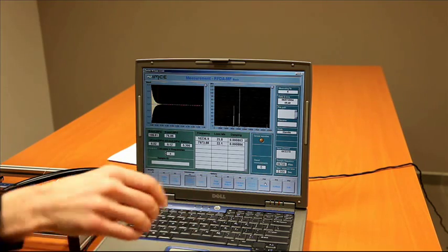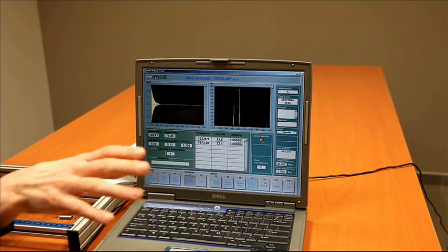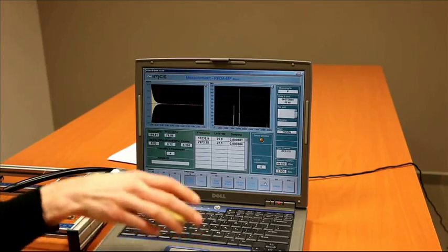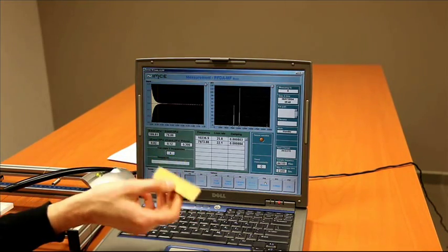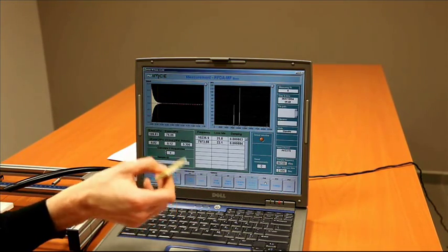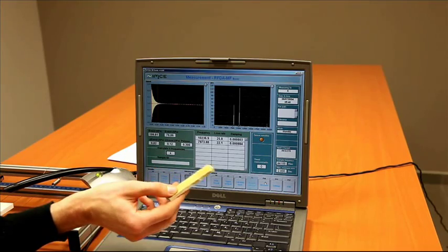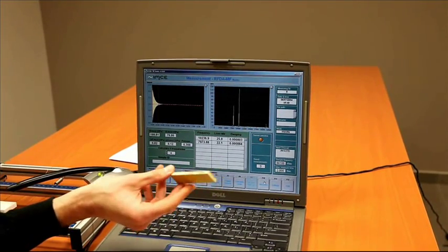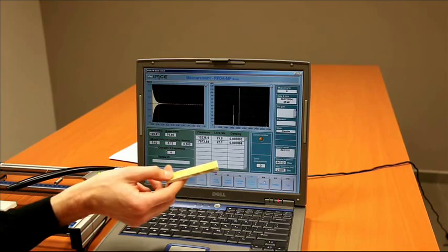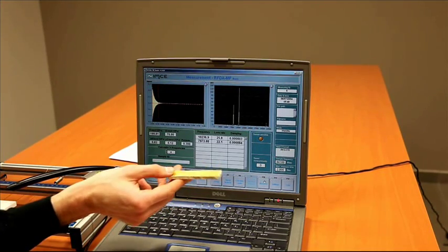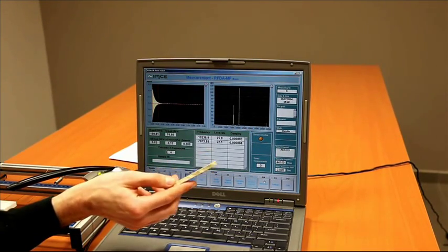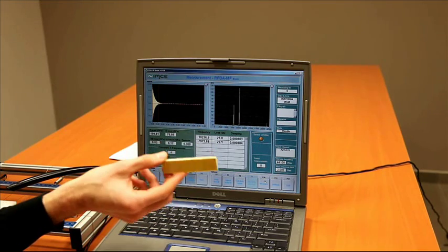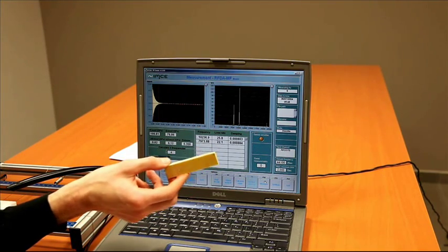Now, let's look at some materials. What's important is that the material is stiff enough so that when we tap the sample, you have a vibration signal. Basically, you have to hear some kind of ping that you can record. If we are going to tap, for example, rubber type material which is not so stiff, we will not hear any ping and it will be very difficult to measure this type of material.